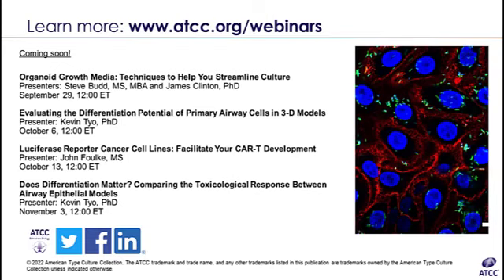Yeah, I guess the best remedy for that, or best precaution, is whenever your cells are out of the incubator, like for a feed or wash change, do it as quickly as you can. And if you're doing any experimental assay, make sure they're acclimated back in the incubator for some time before you do that. That would probably be the best sort of response to that.